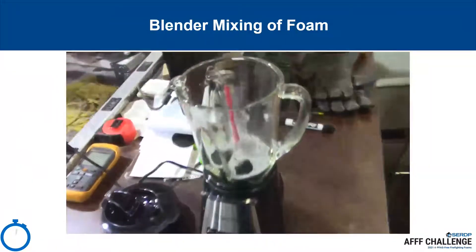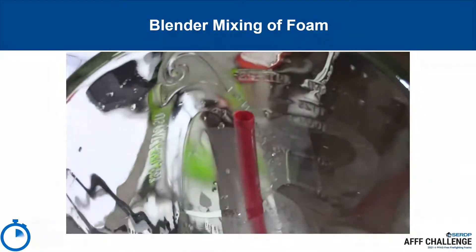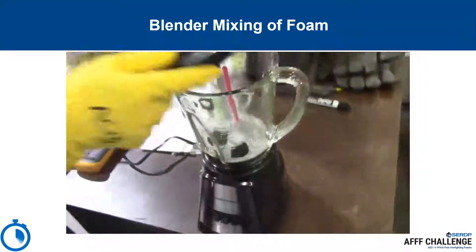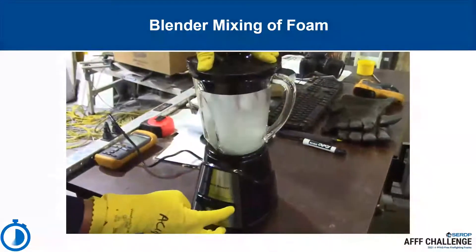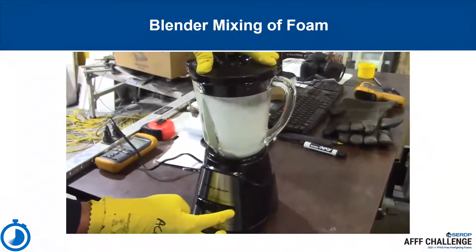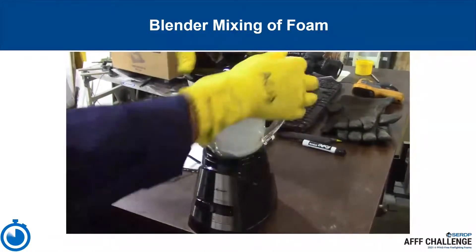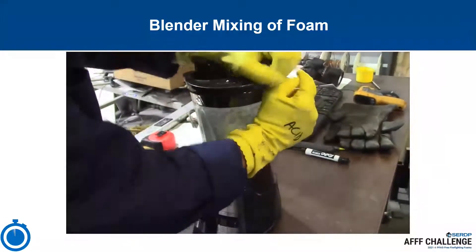This procedure will demonstrate foam mixing of the 3% solution. The blender has already been prepared with a standard drinking straw taped to the side with 2-inch packing tape. The straw should be placed so that air can be entrained from the top of the blender when covered, and released from the bottom of the straw during blending. Using the highest setting, blend the foam mixture for 5 seconds. Note the consistency of the foam product: the stiffness, bubble size, etc.